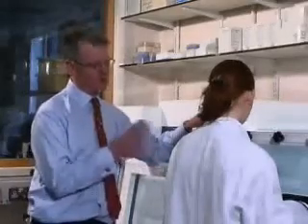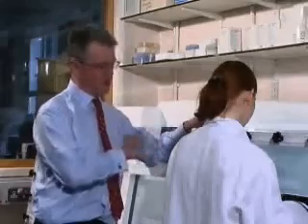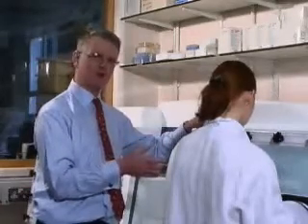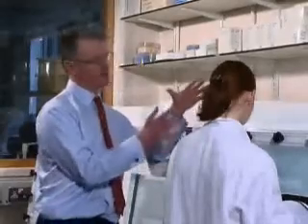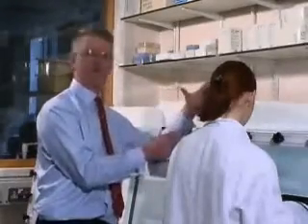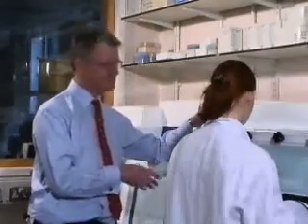And what this kind of apparatus enabled us to do was to open up the cells and extract the proteins without changing the oxygen at all, so that we could see the switch before it had been changed by the oxygen. That was very important for us.